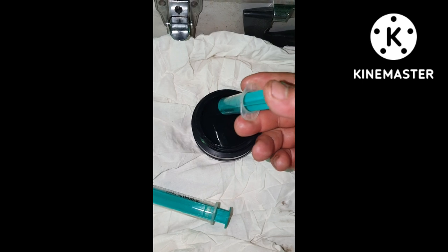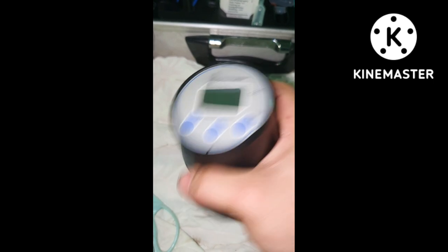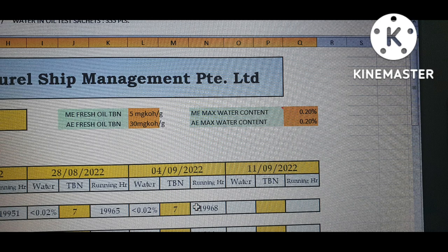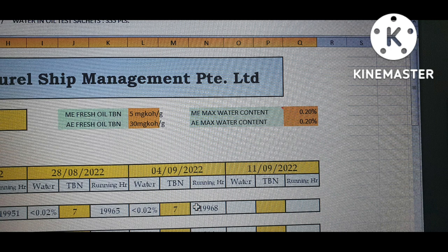Pour 5 ml of sample oil to the lid, and place the lid. Then shake it vigorously. After 130 seconds of shaking, we got a result of 26 total base number. The generator system oil should not be more than 30 mgKOH/g and not less than 20 mgKOH/g. This is based on the company safety management system.